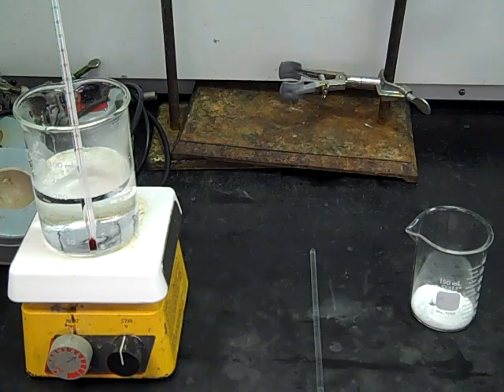Welcome to experiment three. Today we're going to be learning about a technique called recrystallization. It's a way to purify organic solids. After experiment two, you've isolated your organic unknown, and in this experiment we're going to learn how to purify it and then analyze and identify what that unknown compound is.